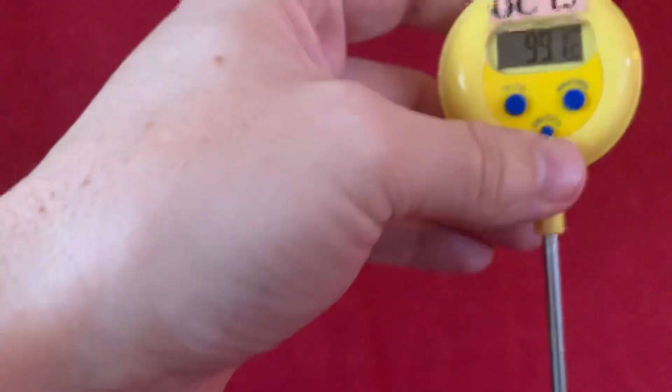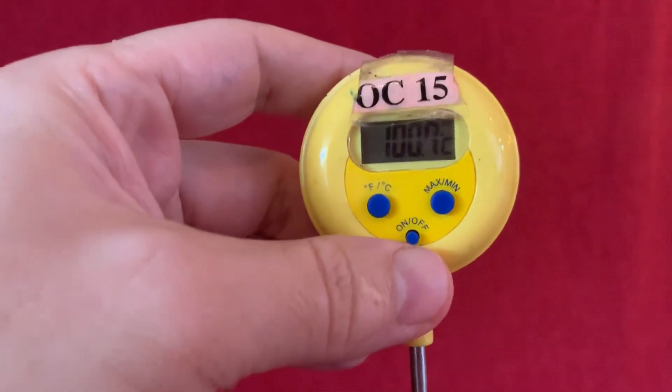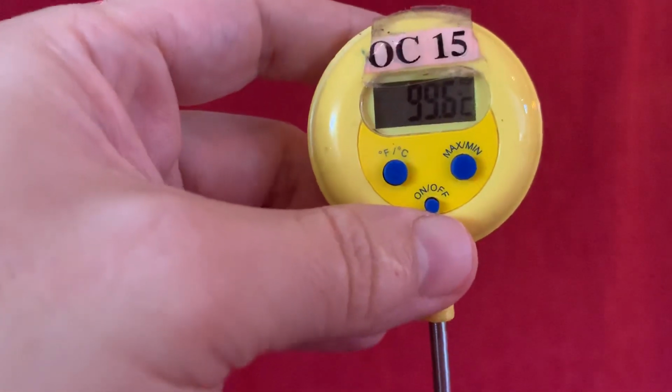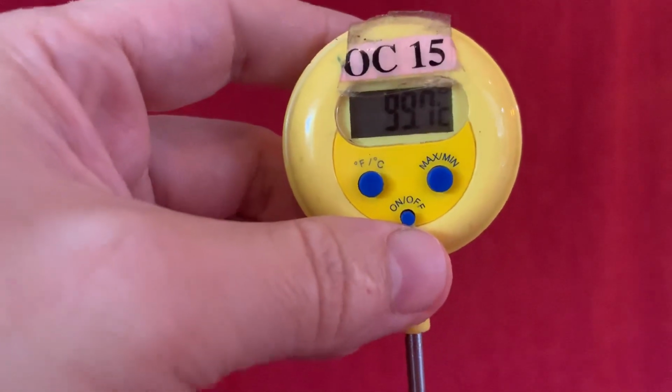Having a bit of a time settling on a single value. Now a sample like this, you don't want to rest the thermometer on the bottom of the beaker because then it might start measuring the temperature of the hot plate. You want it to measure the sample of the water that you're in.